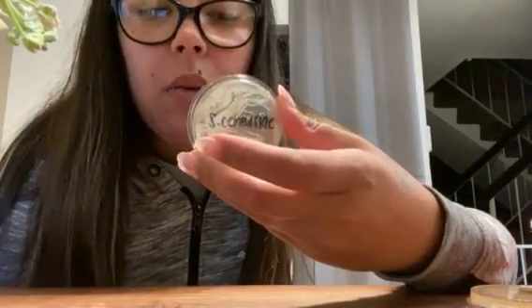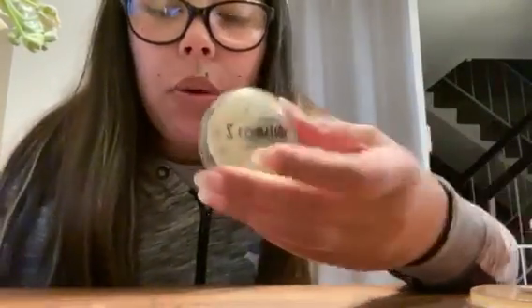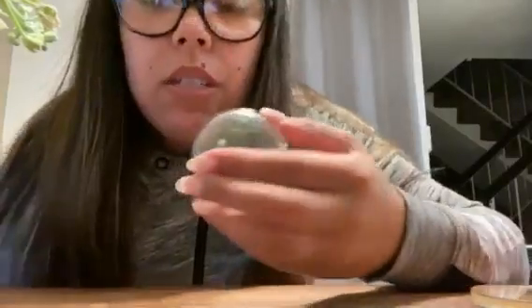I would say maybe E. coli and epidermidis took a little bit longer to develop, where the yeast, the S. cerevisiae one, was a lot faster. And that could be for a number of reasons. When we activated the yeast in the warm water and spread it out, I read that the yeast likes to sit in the dark and at those temperature ranges, and it just grows rapidly from there. But other than that, these were the results of my TSA plates from the tubes and into the agar plates.